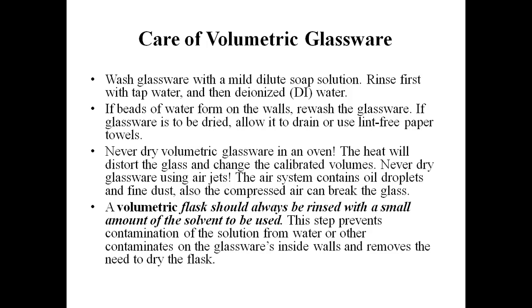How will we care for these different glassware? First of all, wash glassware with a mild dilute soap solution. Rinse first with tap water and then with deionized water. If beads of water are present on the walls of the glassware, rewash the glassware. If glassware is to be dried, allow it to drain, or use lint-free paper towels.